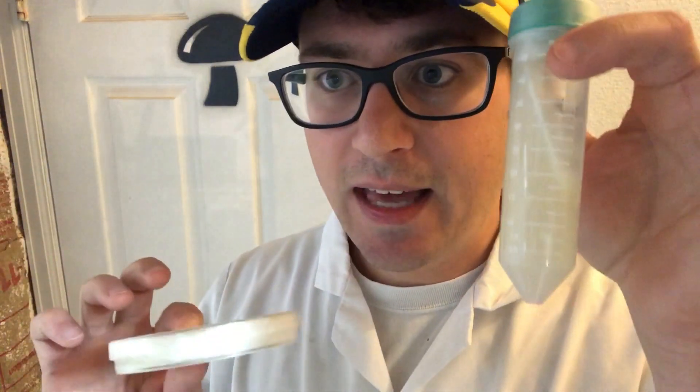Parafilm is one way to prevent that, but petri dishes are not perfect — they're really meant to be used for production and not long-term storage. That's my overview on the differences between a slant and a petri dish.